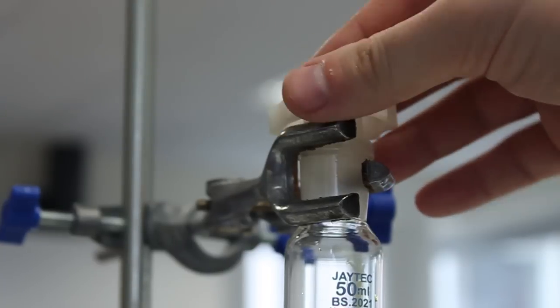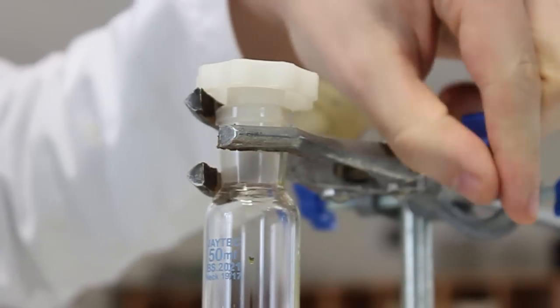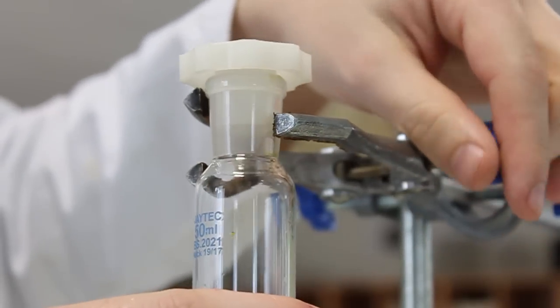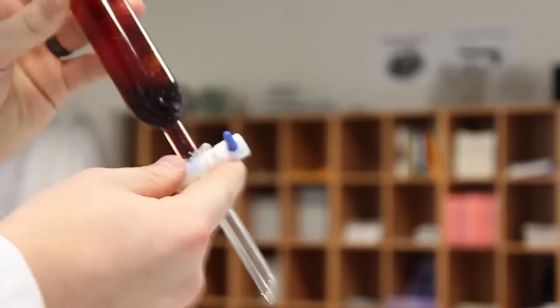Place the lid on the separating funnel and then remove from the stand. Agitate the separating funnel to combine the reagents.